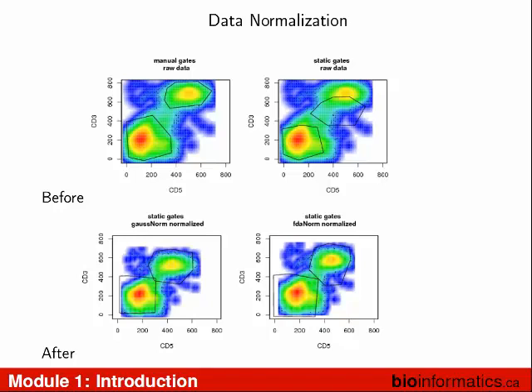There's two reasons why you want to move the gate. So we're going to talk a lot about flow density later on. And flow density is a tool that we developed that is accounting for little minor sample-to-sample variations. So sometimes in FlowJo, you will do some tweaks. So you get the gates, and you want to twist them a little, twist them a bit, because you have sample-to-sample density variation that's small.